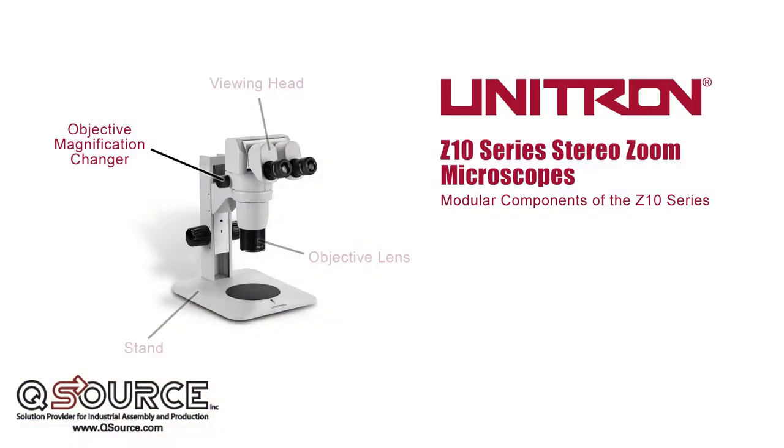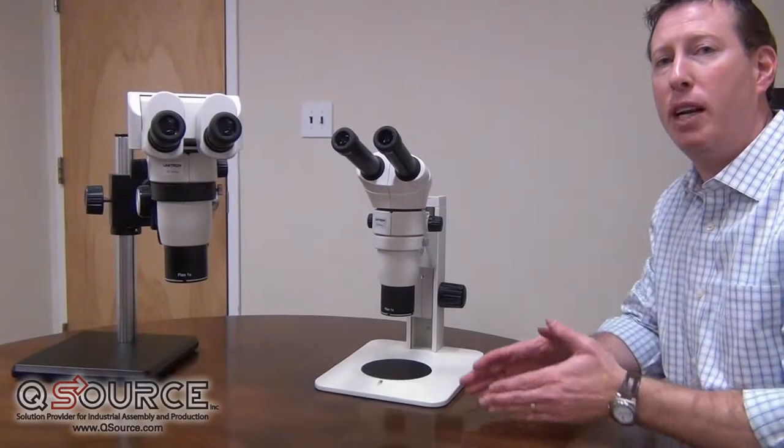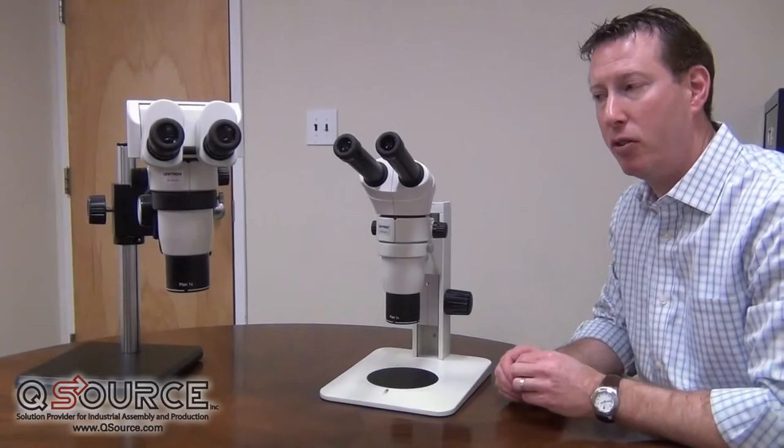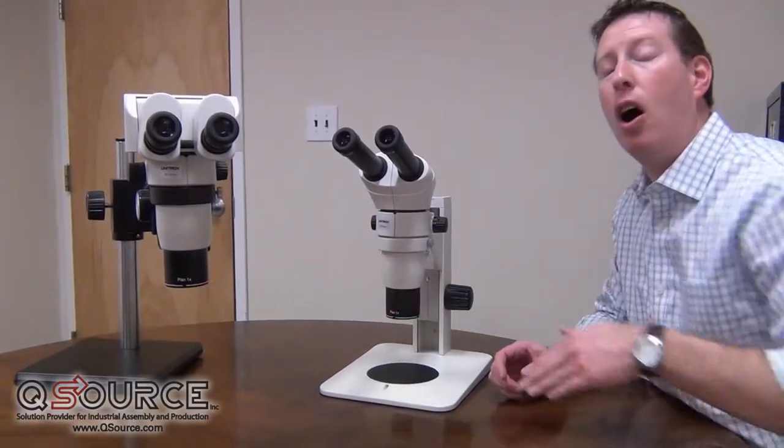The second modular component in the Z10 series is the objective magnification changer. There are three different choices here. The first being the Z10 system — a 10 to 1 zoom ratio which yields an objective magnification of 8x to 80x when coupled with a 10x eyepiece and a 1x objective.